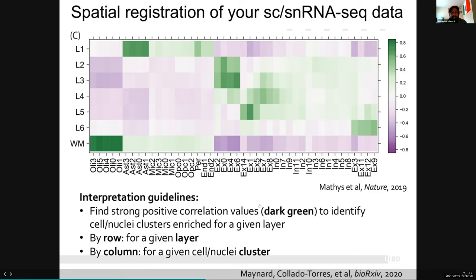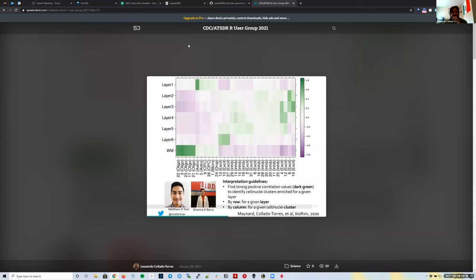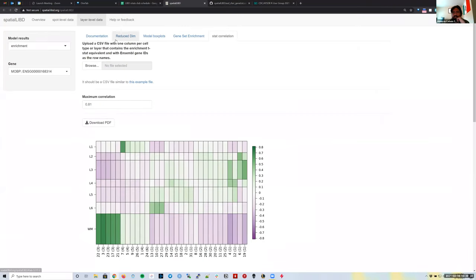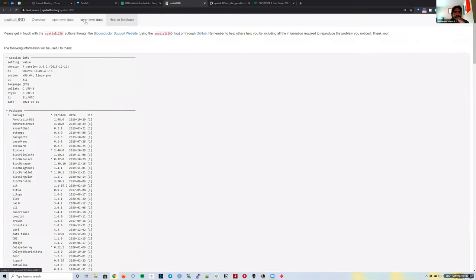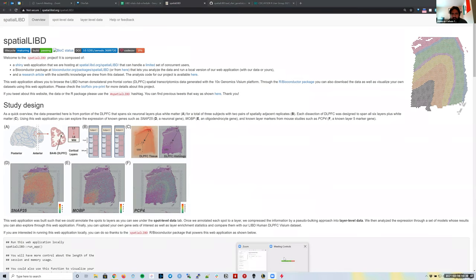To do this spatial registration you need some work outside the website to prepare the data and compute the enrichment test for your single-cell data. But that's basically what this website does — there's more documentation available. With that I'll stop the recording.